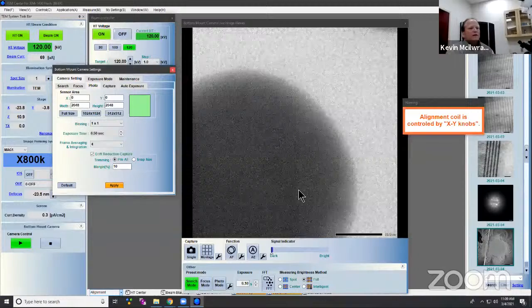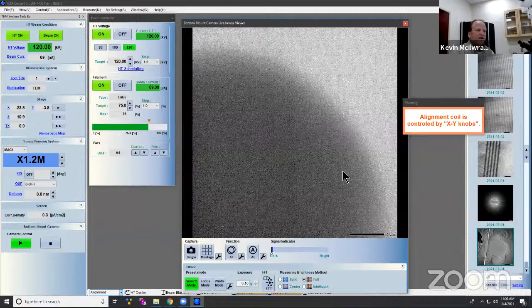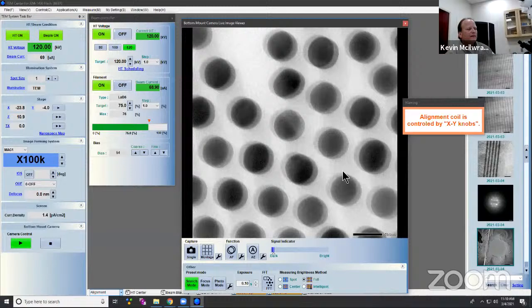So we see here, let's try to go up to here's 1,000,000. And now at 1.2 million, my voice, I can't really talk. So if you're ever in a room taking data and there's people sitting in the back talking, it's usually a salesman in my case, then you have to tell everybody to be quiet. And then we come back here, and this is kind of cool with the sun. So now we're pretty well aligned, I think.